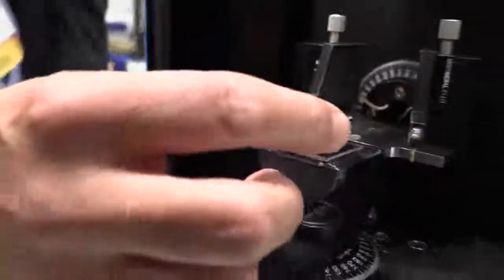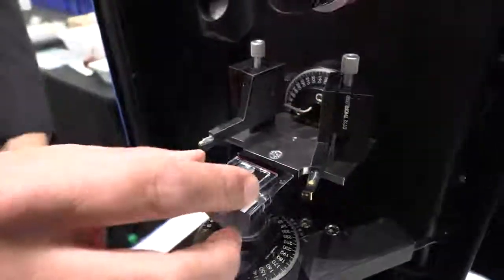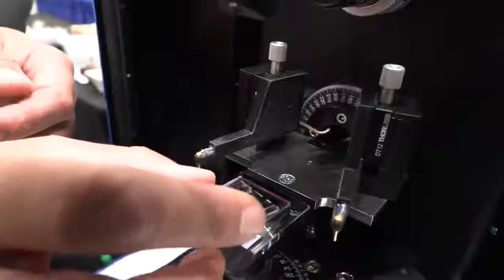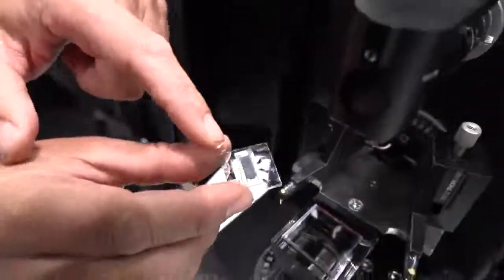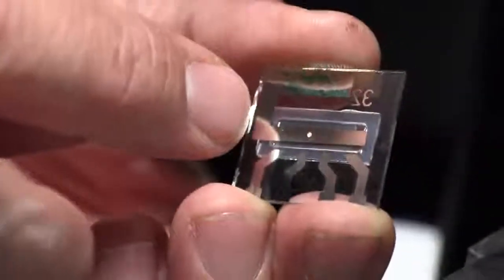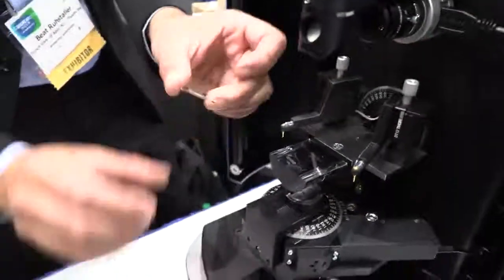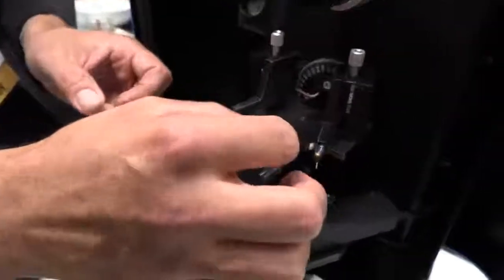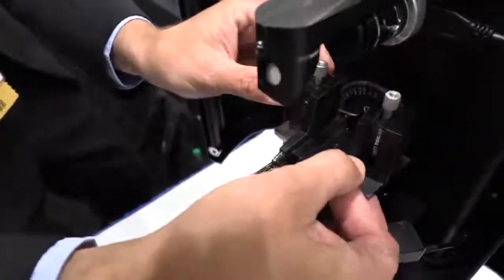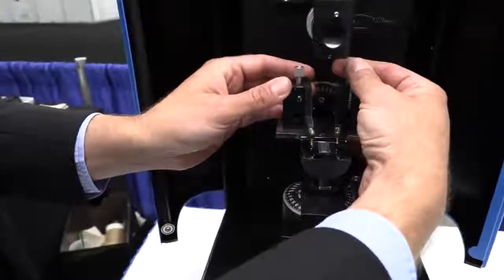And instead of this film, I could also place the OLED here and directly excite the OLED. Instead of doing an optical excitation, I can also do electrical excitation, called electroluminescence. But which part is the OLED? It's not so easy to see because there is an encapsulation glass and a metallic cover. Usually if I have an electrical contact, then the light would come out from this side. But I would have to remove this sample and then place the OLED here, and then make sure to contact the electrical pads. But now, I would still need to change the vertical position here in order to touch these pads.